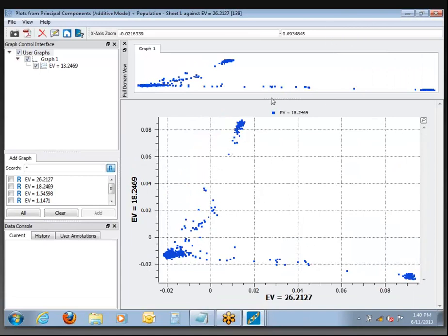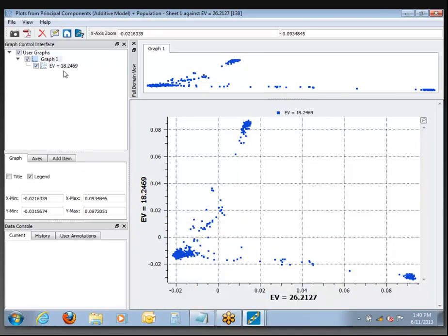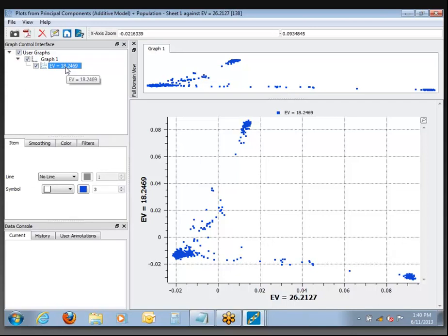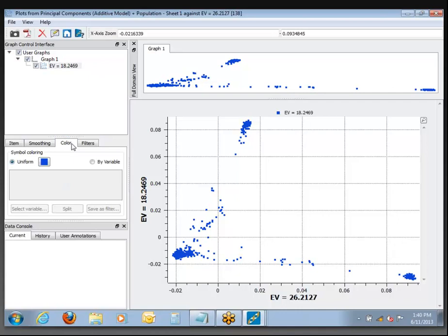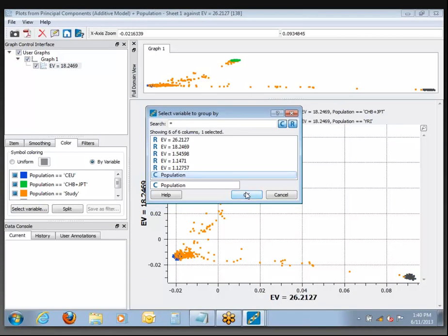If we want to figure out more about what's going on here, I'd like to recolor the points based on that population variable we merged on. Just like before with the histogram, if you want to recolor individual plot points, click on the actual plotted variable — it's labeled according to the second component name since that's the one plotted on y. When you click on it, you get the option to color by variable. We'll use the population variable and click OK.